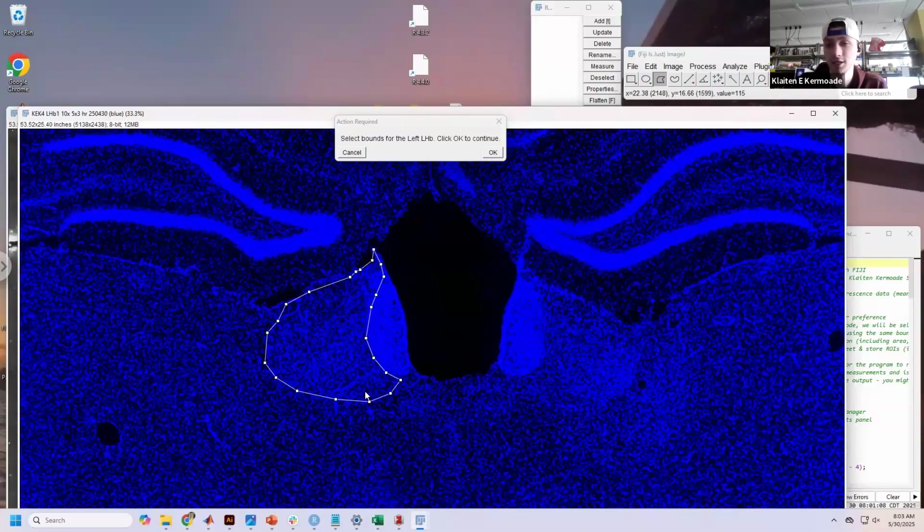But I would, especially Portia, but also Emily, use your atlas to help distinguish what you think the lines are for the LHB. As you move on, you probably won't need the atlas as much, but best to start with the atlas and then go.